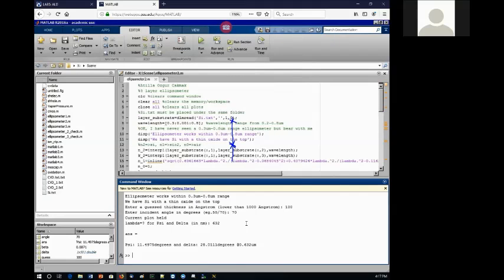Now it's going to become like a number game, because I hope you can see these two numbers here. These are the measurements the ellipsometry would expect. So what it's telling me is the following: if you're doing a 70-degree incidence angle, you will see that psi will be 11.49, and delta will be 28.01. Okay, let's just keep them there.